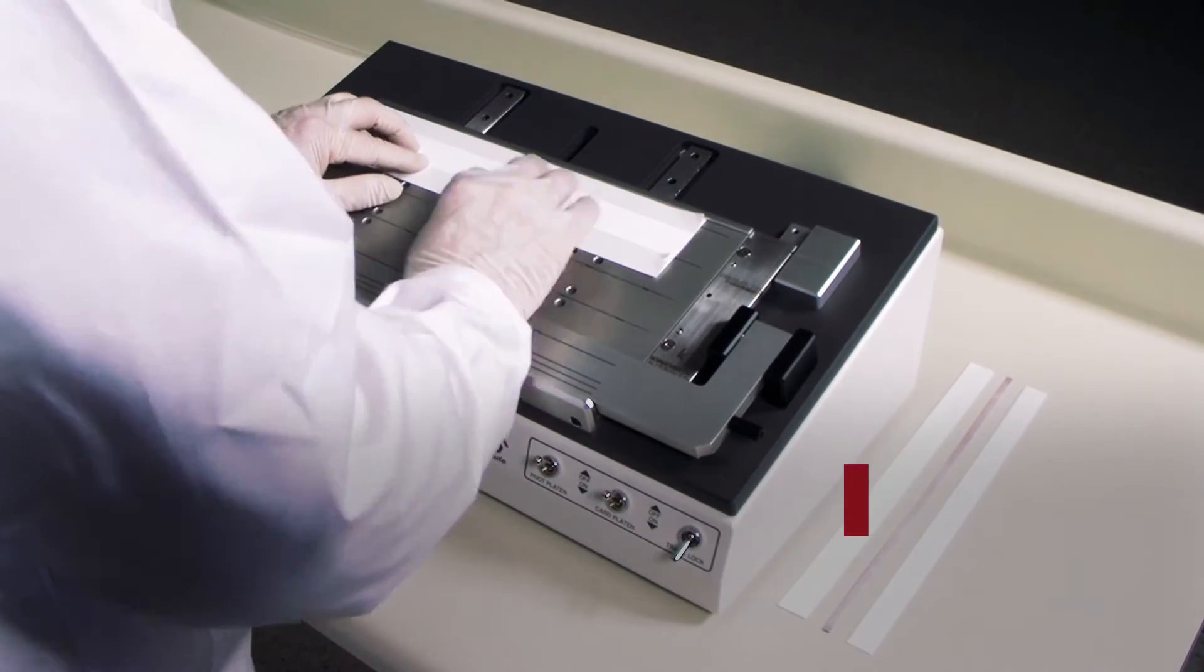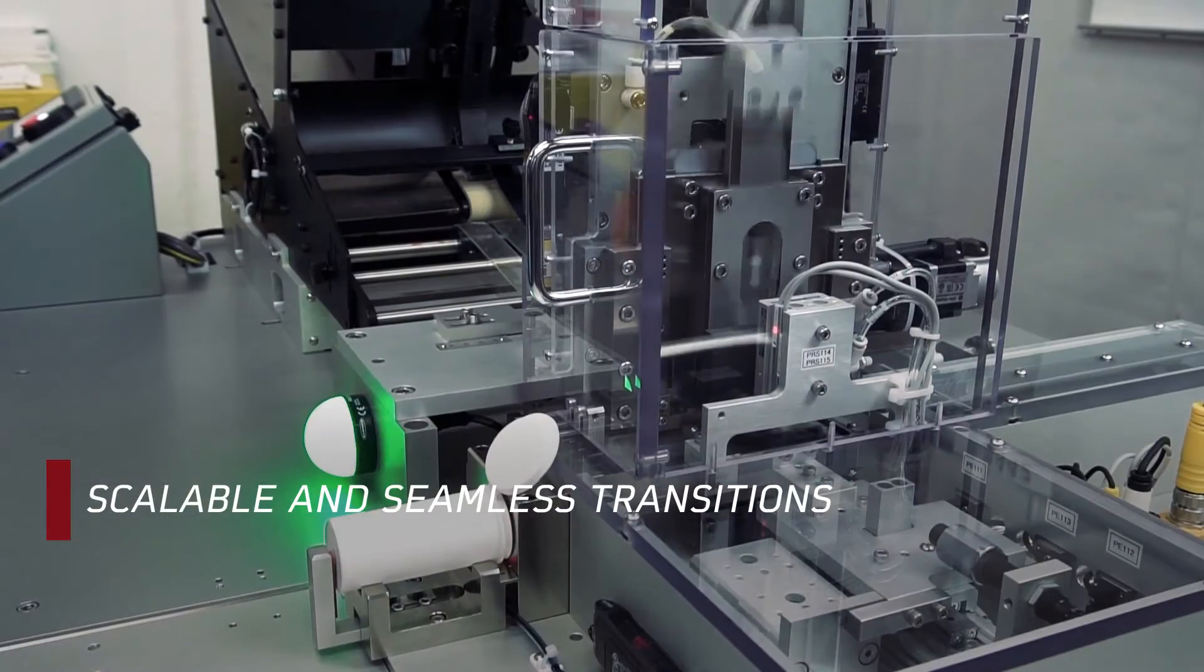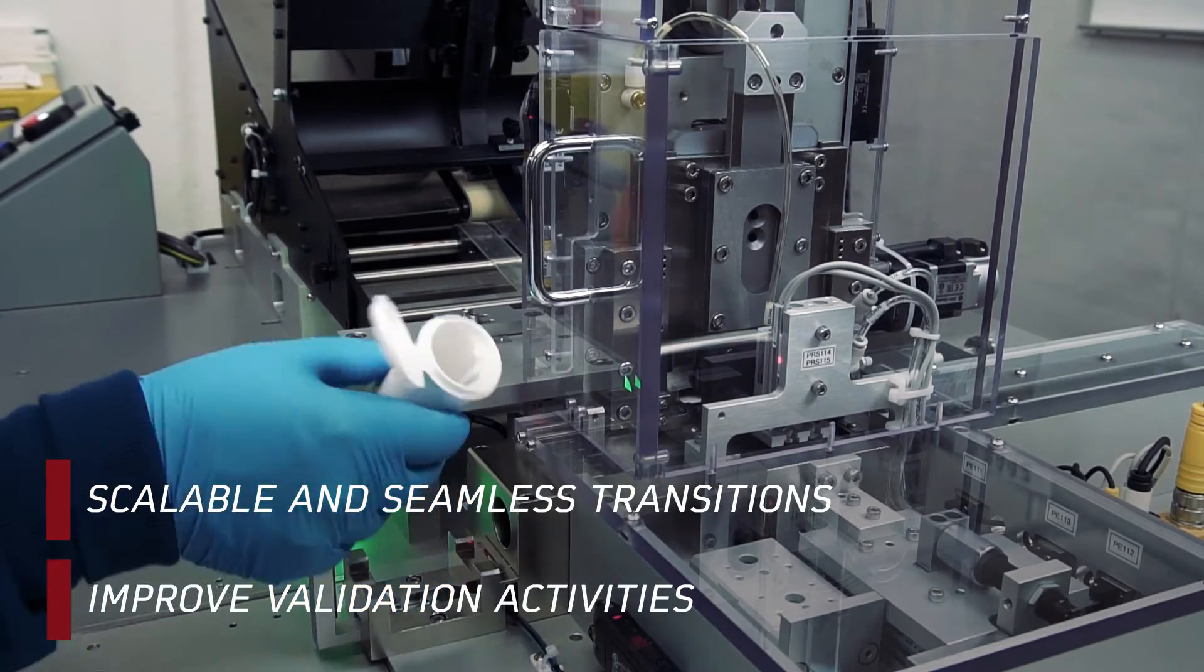These systems allow for flexible, scalable, and seamless transitions when moving from benchtop to more automated processes which greatly improves validation activities.